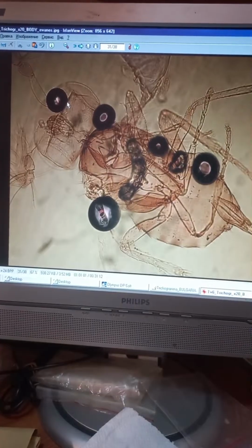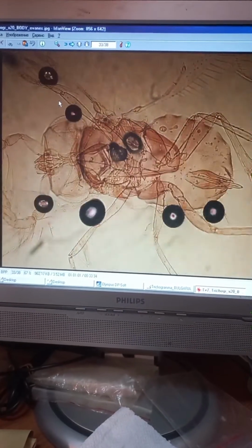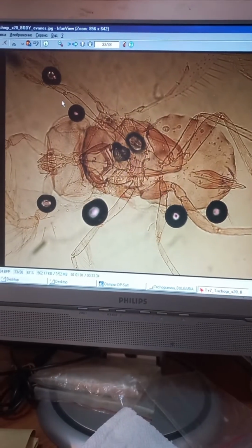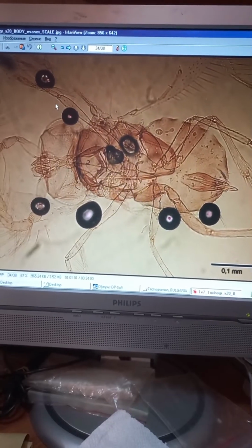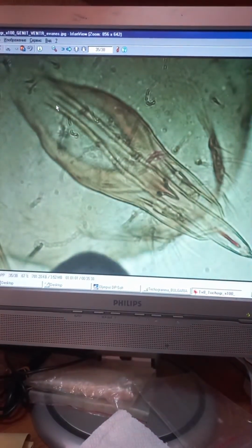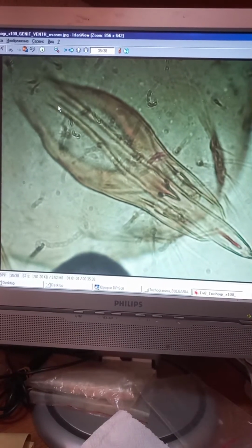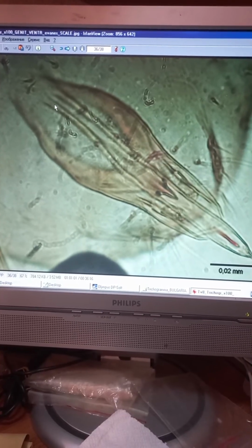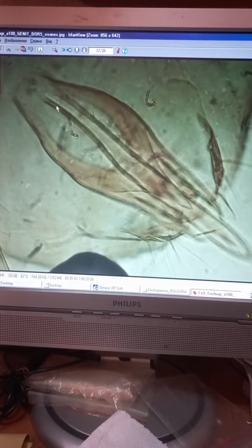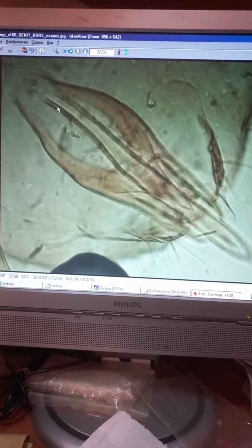Body, 200 magnification with some bubbles, unfortunately, but genitalia are visible. Body size 0.5 millimeter, very small. Here, genitalia very narrow and sharp intervolsellar ventral process and very wide dorsal aperture of male genitalia.